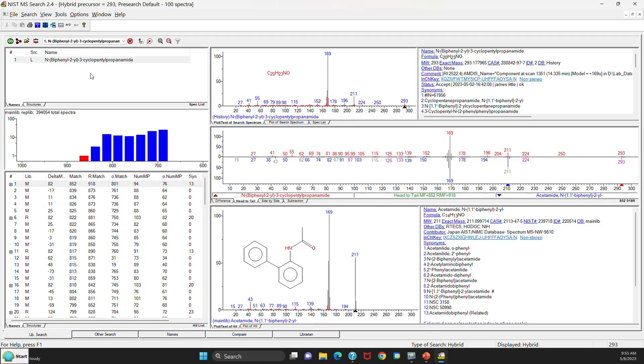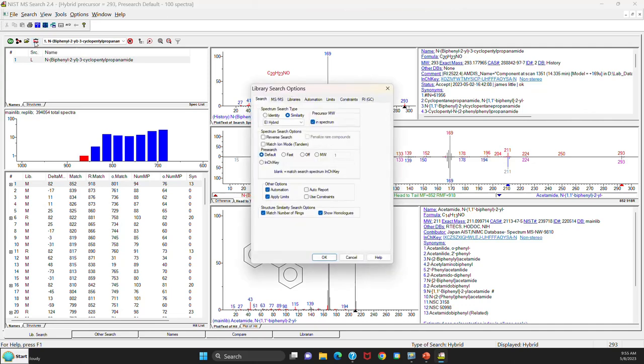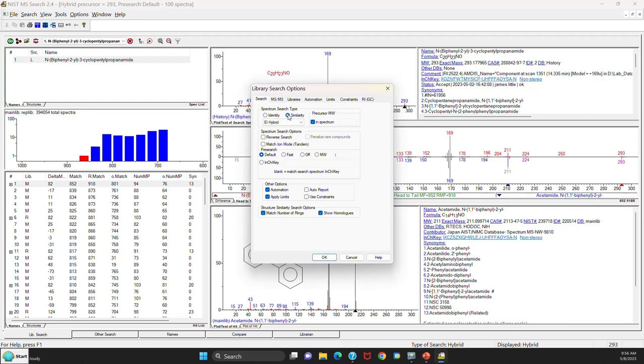Before we look at the version 3.0 software, I need to review what the windows look like in version 2.4. So if you go up to the library search options and open that window, you'll see that when you're doing identity searches here, you have the EI in addition to the MSMS type searches. And the same for the hybrid or the similarity searches, you'll have all of them here.